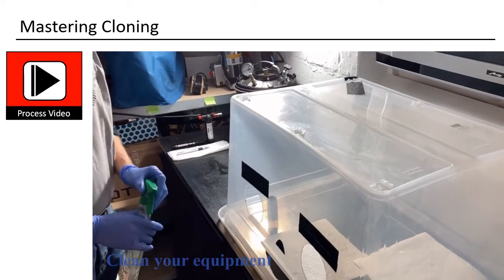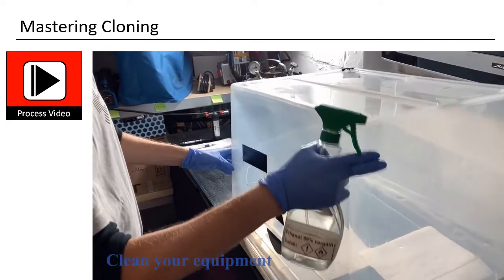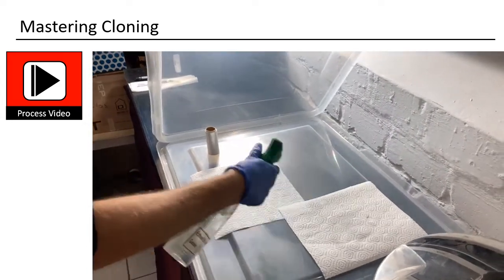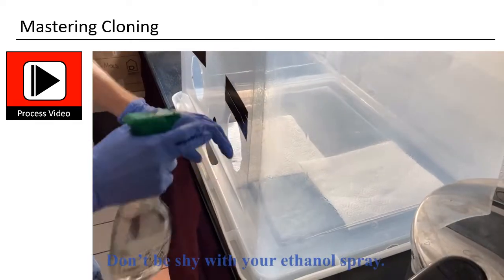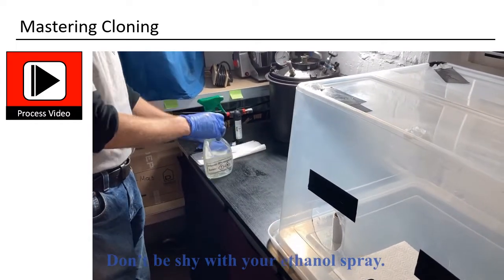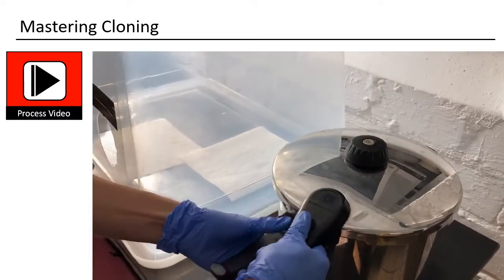Start by ensuring a hygienic environment. Clean the still air box in advance. Apply some ethanol to disinfect. Use a knife. Disinfect before using it. After opening the pressure cooker, work very clean. Always spray your hand. Wear a mask and a cap. Put the petri dishes inside the still air box.